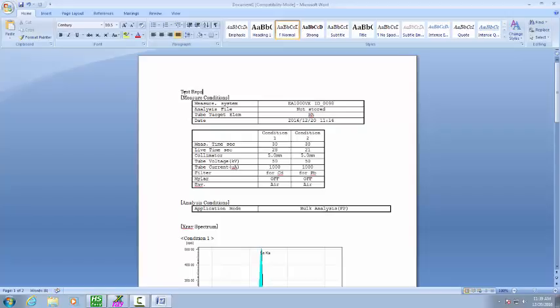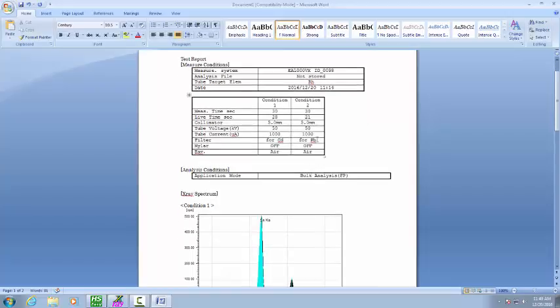Report. And you'll see the measurement conditions: EA 1000 VX, the time and date it was done. All the measurement conditions that were used are reported here.